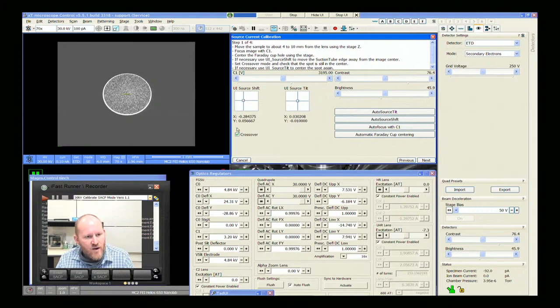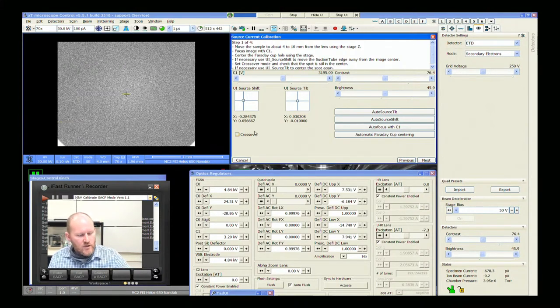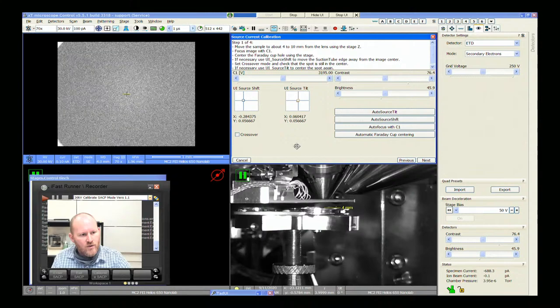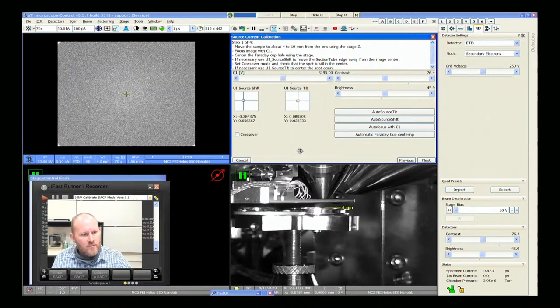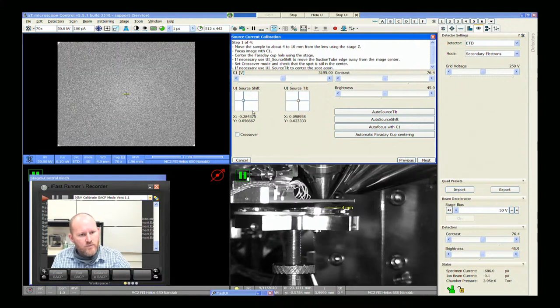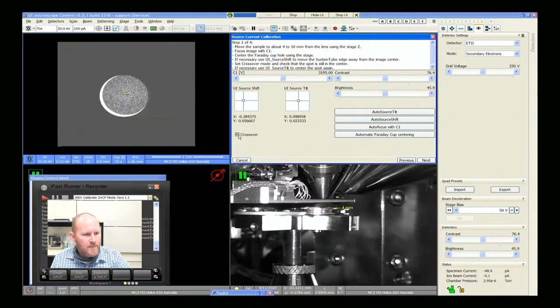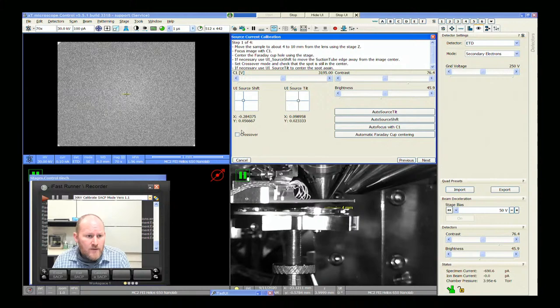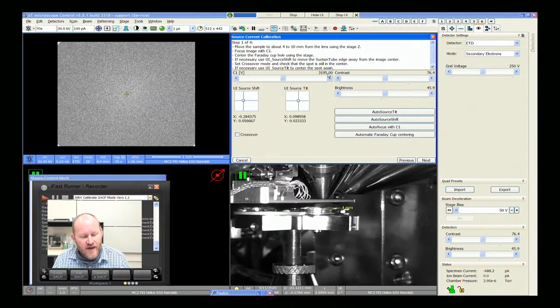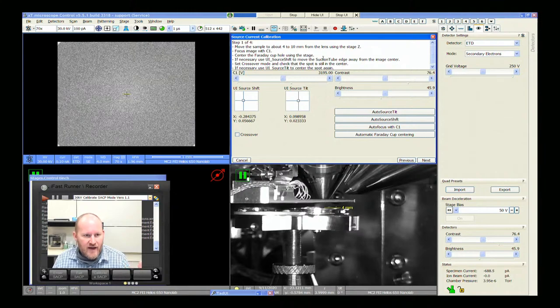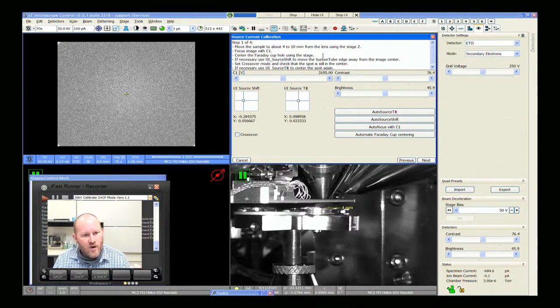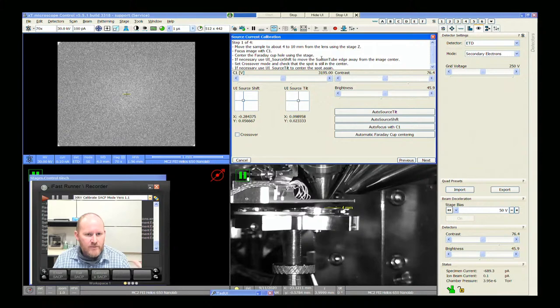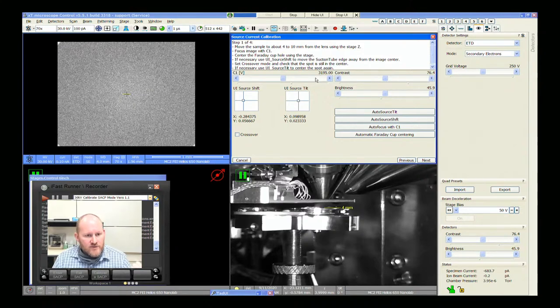There's a little component of shift every time you tilt, so it's sort of iterative. If I go out of crossover mode, I'm not quite perfectly aligned but that's okay. The whole point of this step was just to find the C1 value and utilize the fact that this alignment will turn C2 off, retract the apertures — the electron beam defining aperture — and then allows us to focus with C1.